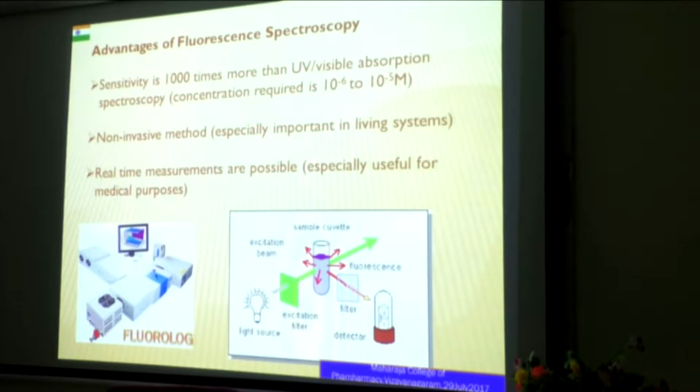And then it is much better than your radioactive technique. With radioactive techniques you have a problem of health hazard. Those radioactive rays hit your body, and you have a problem in the long run. You cannot work on it, so it is limited. You can use it, but it is limited. Whereas this one is more sensitive than your radioactive technique. That is another advantage. The only thing is that the molecule should be luminescent. It should show some fluorescence or phosphorescence or any kind of luminescence. That is the only criterion.